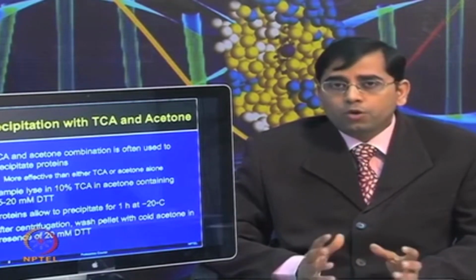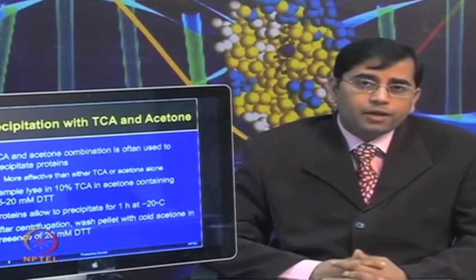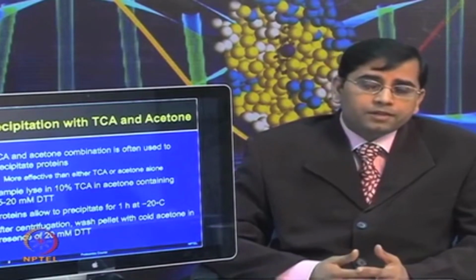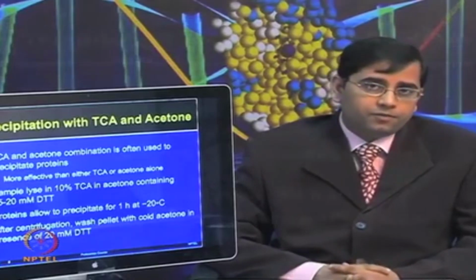Try performing the whole step in cold condition, so that you can avoid proteolytic degradation. Even in this step, the acetone with 20 millimolar DTT will be effective.